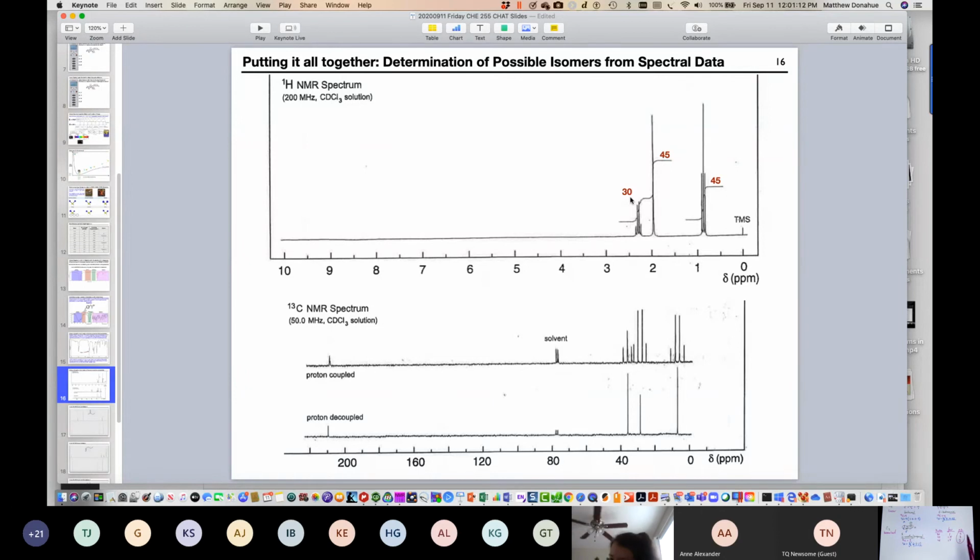So in the chat box, from this proton NMR data, we used those ratios. We're basically figuring out from these numbers what the ratios are. So it's 2, 3, 3, and look, that's what we found here, right? So using that data, we can eliminate the other option.